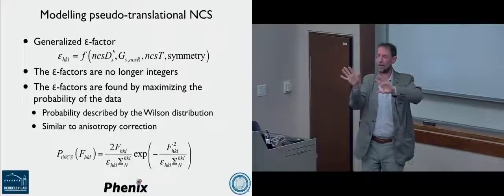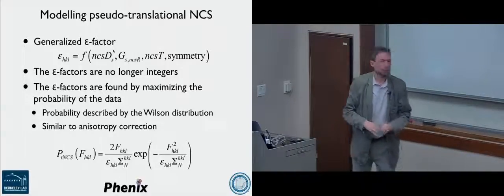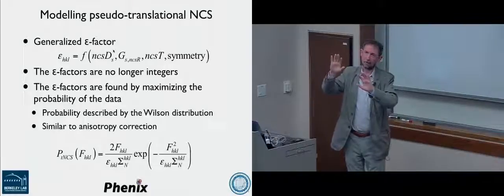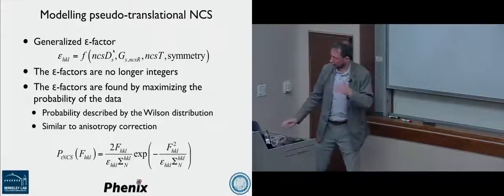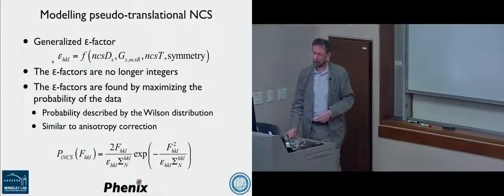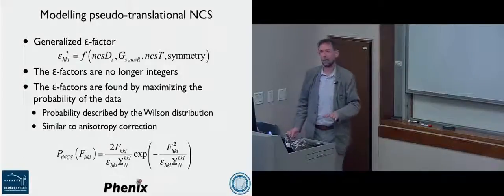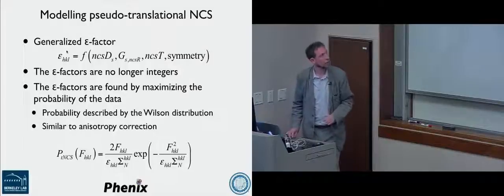says, well, what's the rotation between the two spheres in reciprocal space? And also optimize the translation vector, because it might not quite be half a unit cell, it might be 0.47 in fractional space. And then we won't go into the math behind this, but you can then represent the effects on the diffraction pattern and the intensities with what's called an epsilon factor, which is part of the standard description of reflections anyway. We just never talk about it.